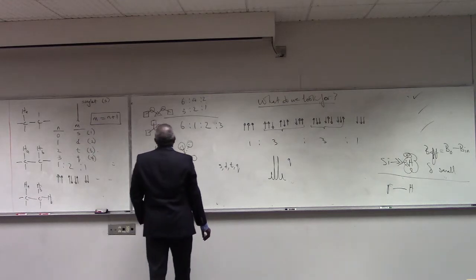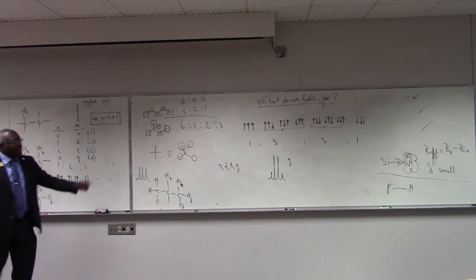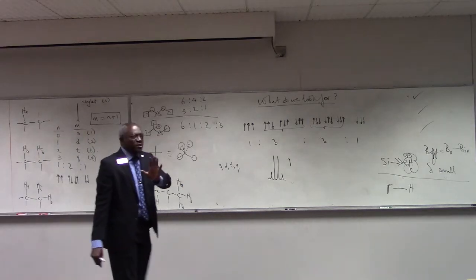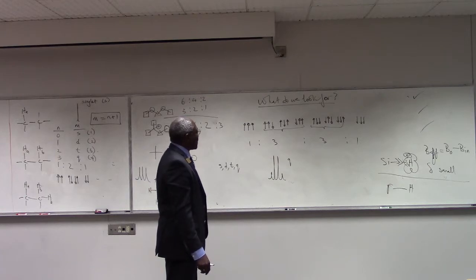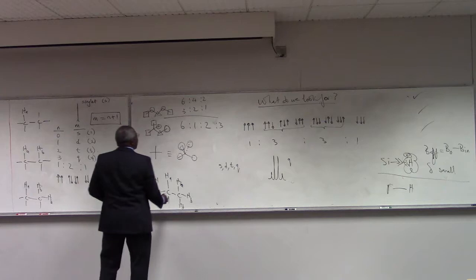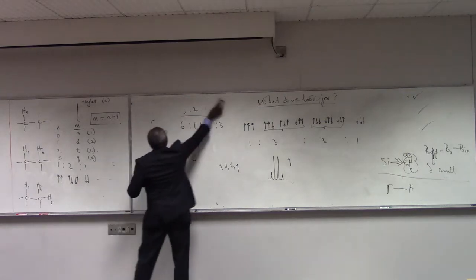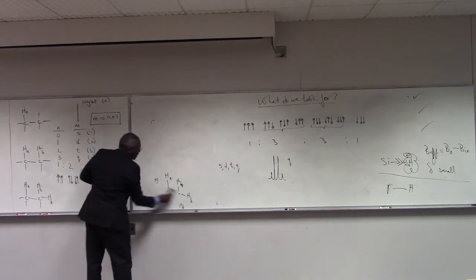All right. Okay. And then the last thing was the coupling constant, which I'm just going to leave out. We're not going to worry about that at any kind of length. Okay. So the last thing we're going to do before we end this lecture is to look at certain spectral patterns and certain telltale chemical shifts.